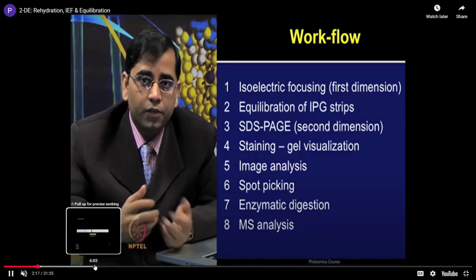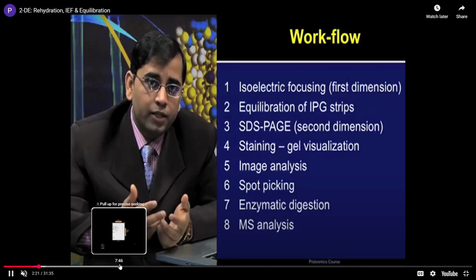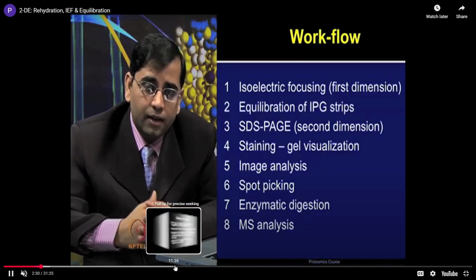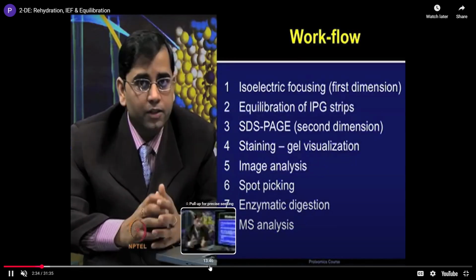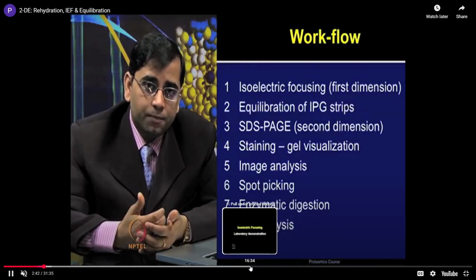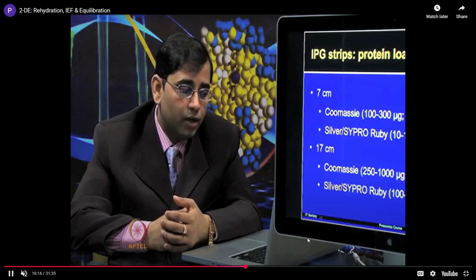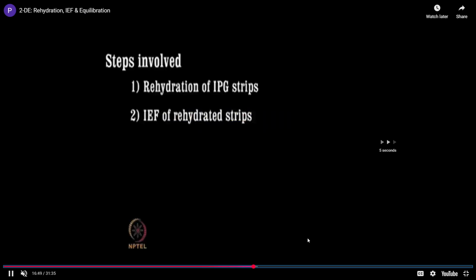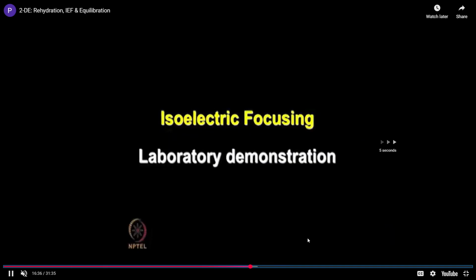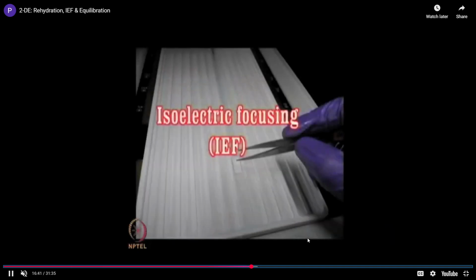This is the animation, but I'll go towards the in-lab protocol one. So the first step is isoelectric focusing, how it is done.